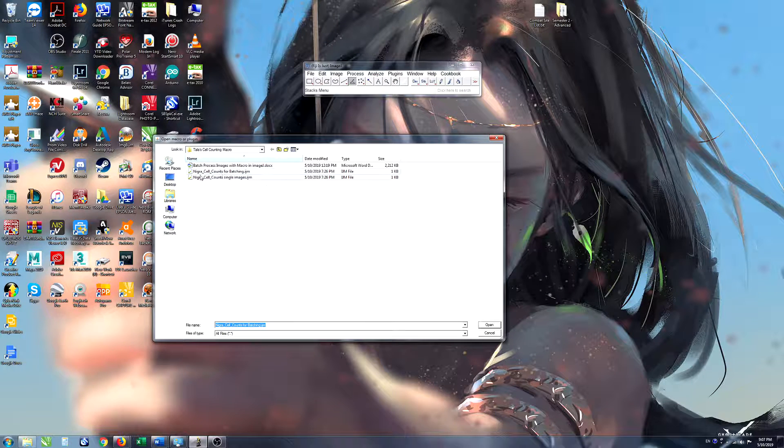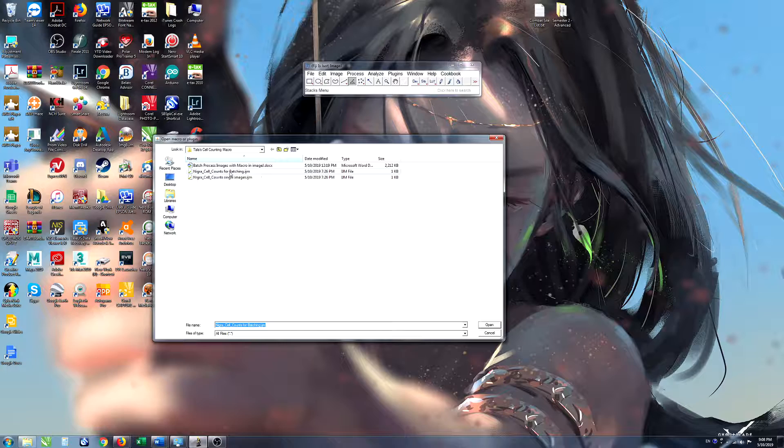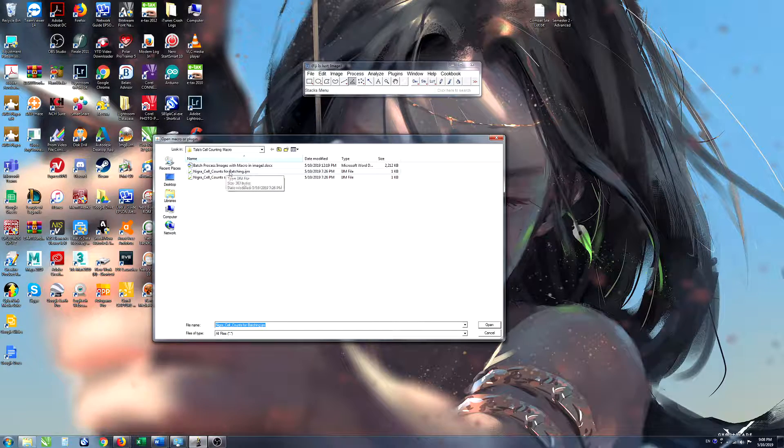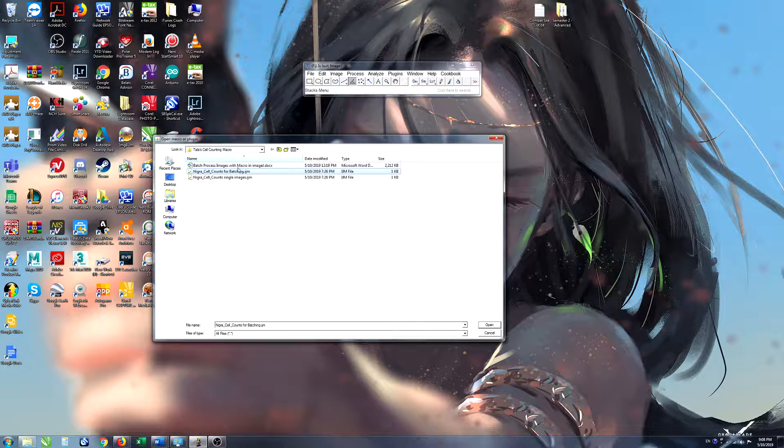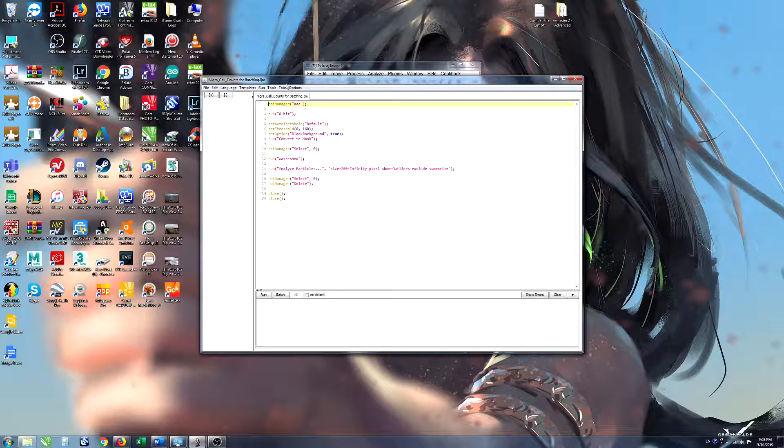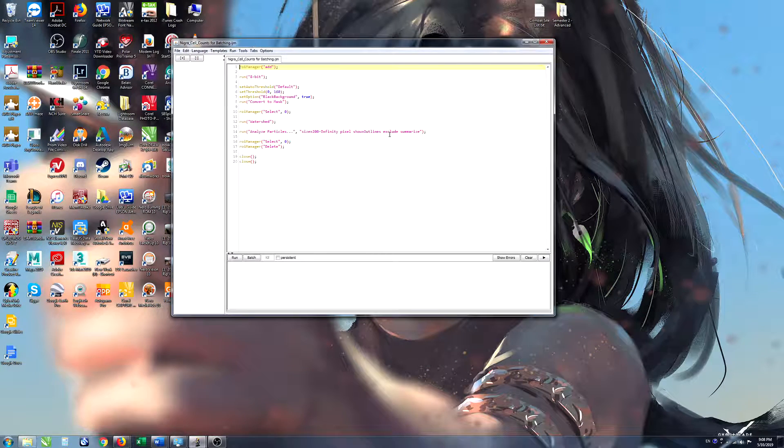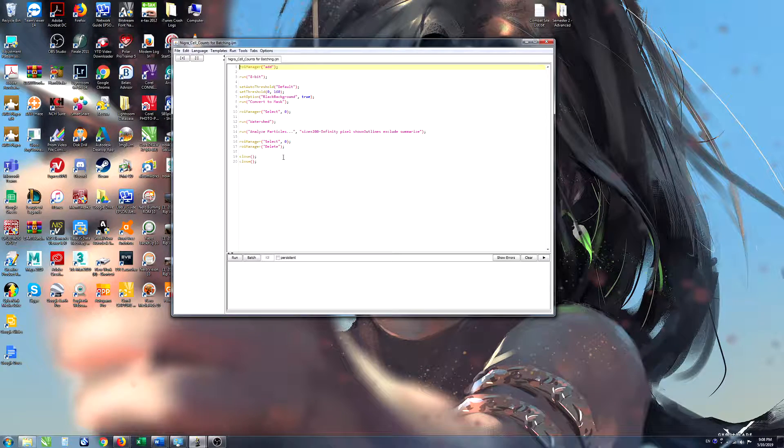We're going to click on Plugins, Macros, and Edit. We'll have a look at this Nigra cell counts for batching macro that we use because that's the one that we use to generate the data. If we double click on that the macro gets opened up in this editor.